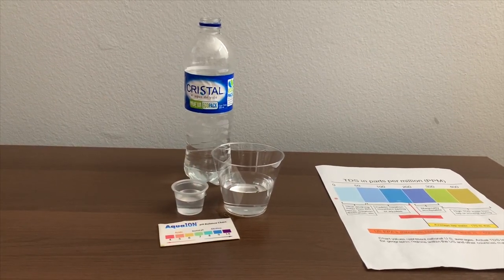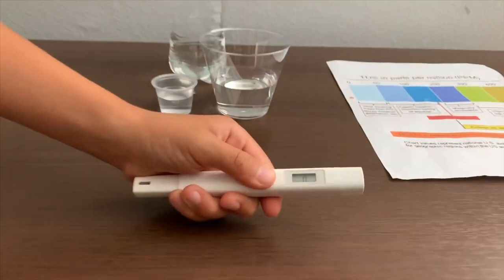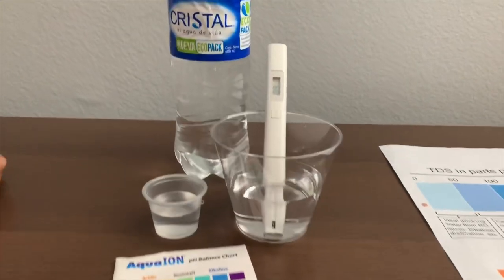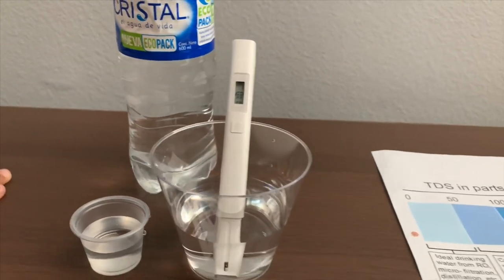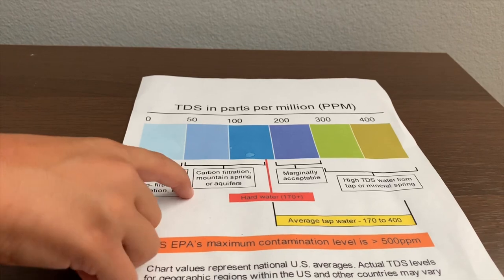First, let's test the TDS level. If you want to buy this TDS tester, check the link down below. Turn on the TDS tester, make sure it says zero, and put it in. One hundred ten. That is carbon filtered mountain spring or aquifers.